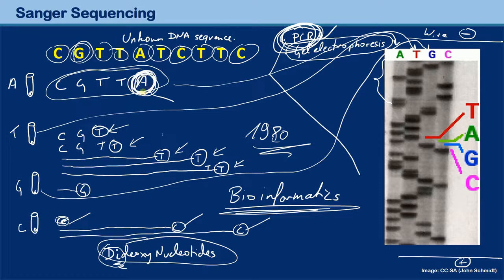So just to clarify, all the other nucleotides before are normal nucleotides, even here in the T, okay? This T over here, which is before the final one, is a normal nucleotide. But if the PCR starts to use a dideoxynucleotide, then the polymerase in the PCR is not able to continue to make DNA, right? And then it stops here, okay? And that's basically it, okay?